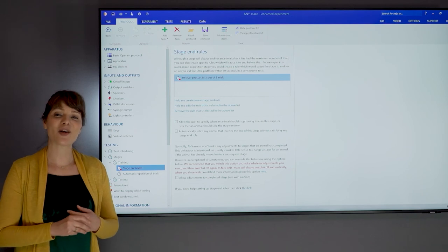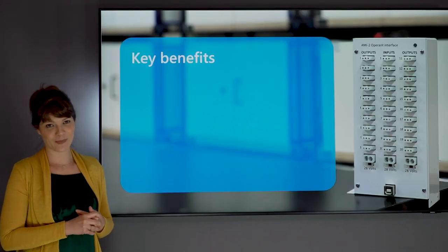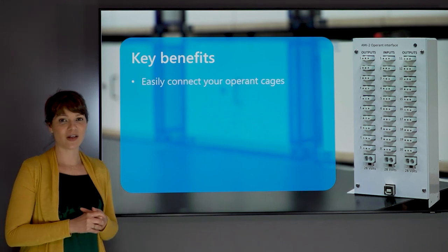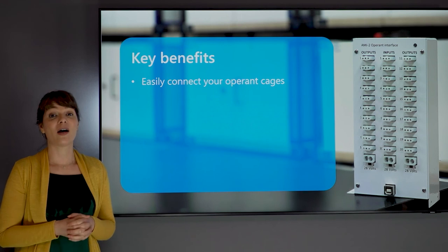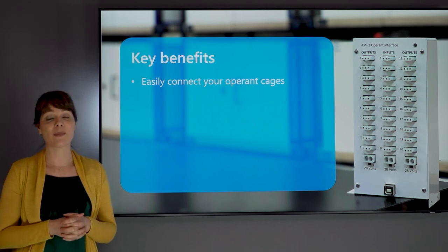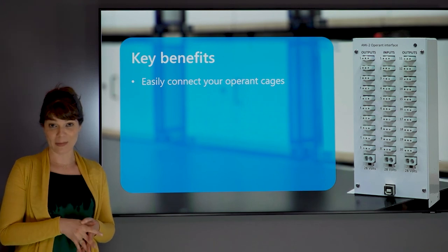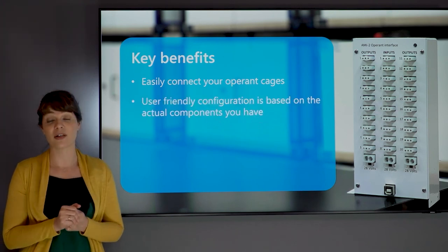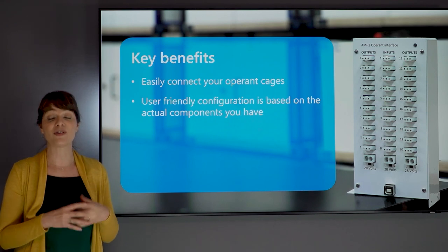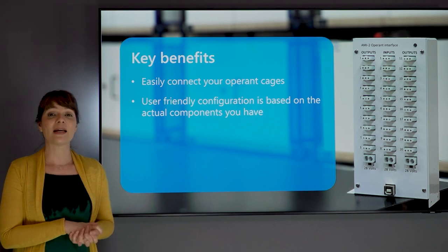We are reaching the end of this webinar, so let's summarize the key points that we've covered. The Anymaze Operant Interface family was specifically designed to help you connect equipment from Med Associates, Lafayette Instruments, Coulbourn Instruments to Anymaze. The Anymaze user-friendly configuration makes it easy for you to define what components you have and where they are connected.